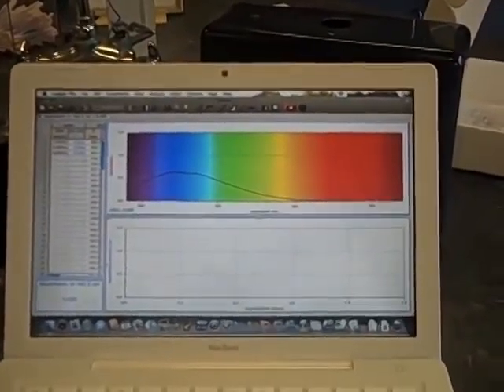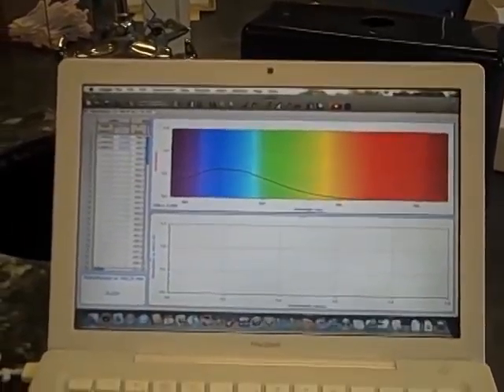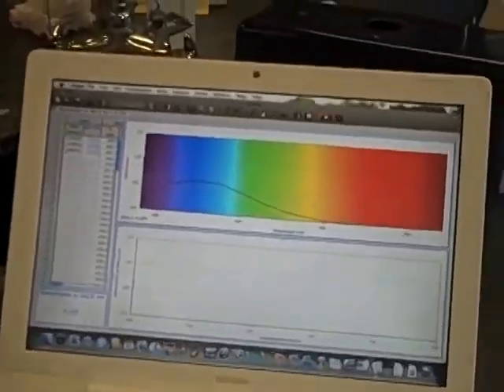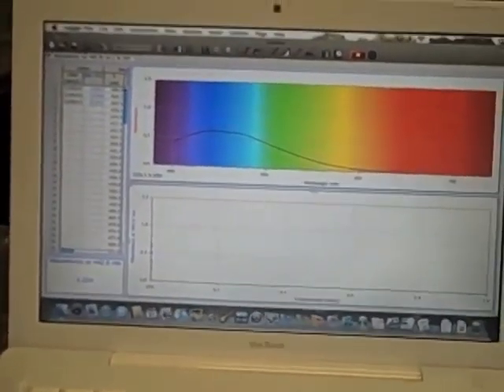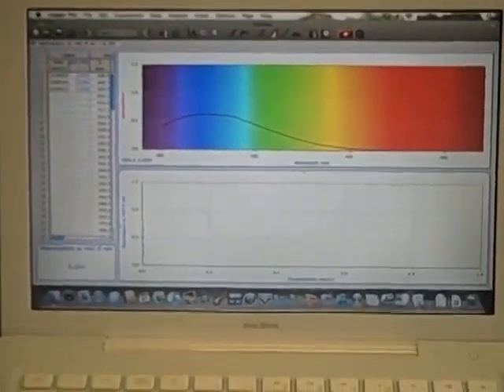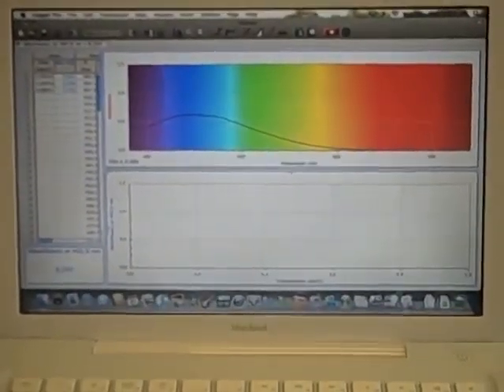Okay, so we're putting number 4 in, and we're making sure that we're putting the clear side of the cuvette where the light passes through. The ridges should be opposite. And if you get fingerprints on there, why could that mess up your result?